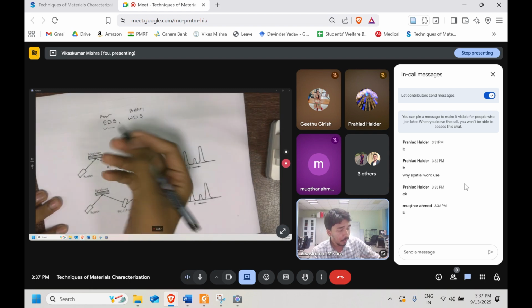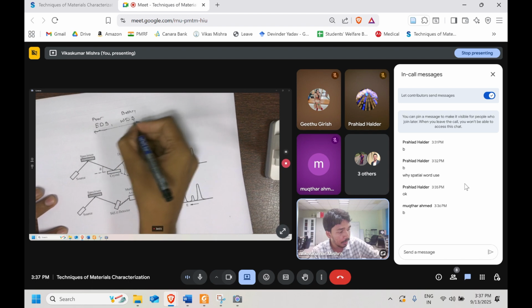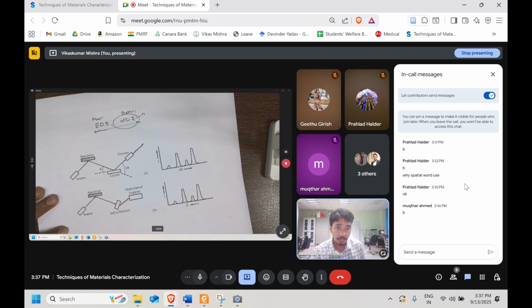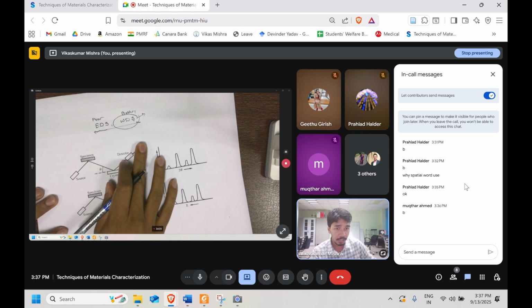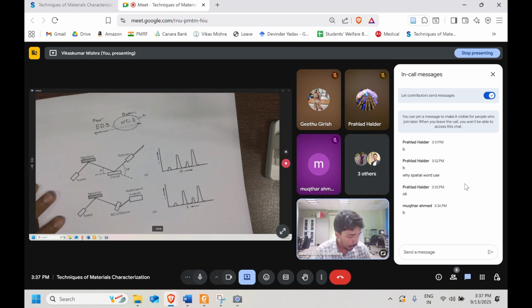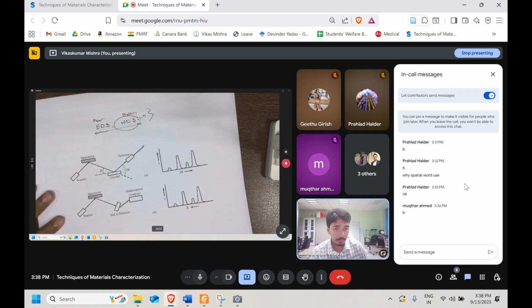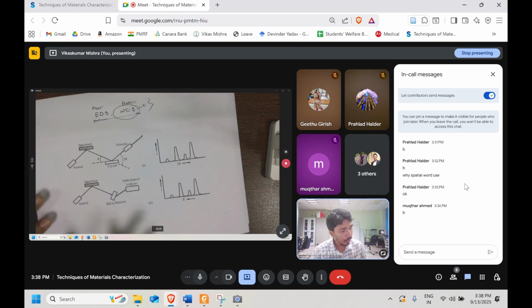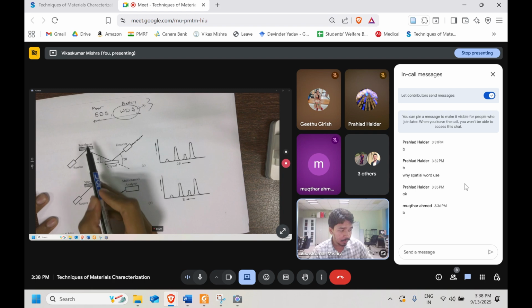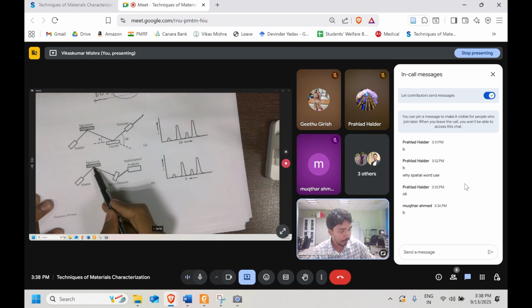Depending upon the question, like a comparison between the EDS and WDS, we can say that the resolution of the WDS is far better. You can trust this data, even the compositional information and the stoichiometry it gives. Now, what is the fundamental difference between them? Here, the source interacted with the specimen, and X-ray is generated. Let's talk about this. The source and specimen are there. Now the X-ray is generated and goes to the detector.